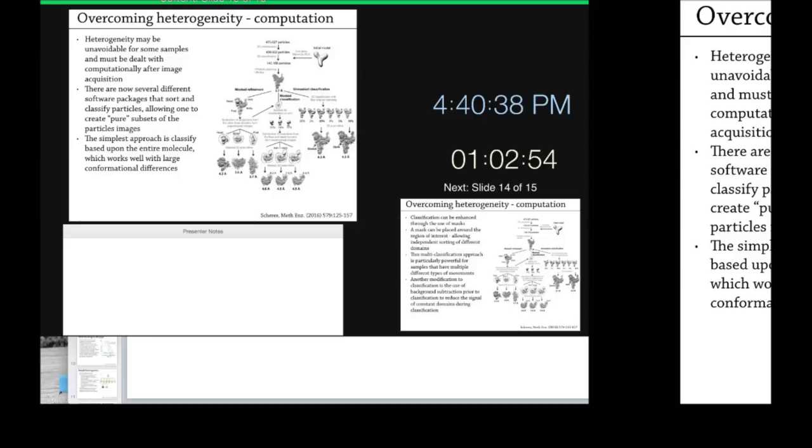And so I think a lot of people are going to continue to do this: add ATP at sub-saturating concentrations if you have an ATPase or something that's conformationally regulated by ATP, and look at the response. For decades we've been doing assays where you add something and look at some sort of response, but now with EM, heterogeneity isn't necessarily a downside. With crystallography, if you had multiple conformations, you just had a bad crystal. Now you can have multiple conformations on your EM grid, and if you can sample them well and actually characterize the majority of the particles, not just a fraction of them, then you can start to make biological conclusions based on the particle distributions at different ligand states.